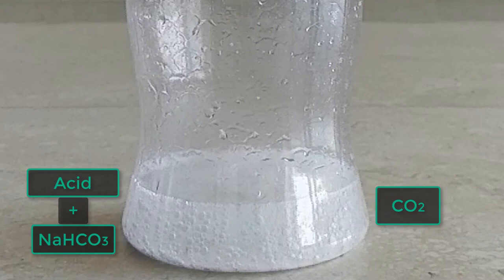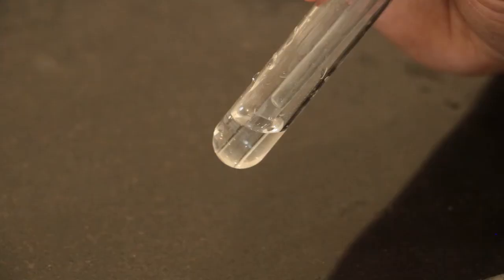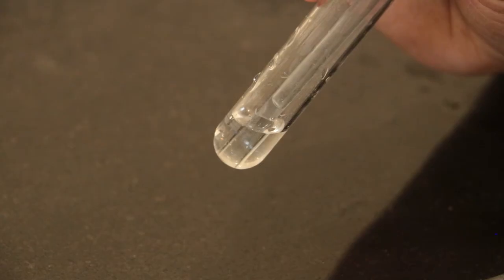So see, for that we are going to do a lime water test. For this, I'm going to pass this gas through a solution of lime water. By the way, in chemistry, whenever I say lime water, I do not mean lemon juice. I mean a dilute solution of calcium hydroxide in water. Meaning I'm mixing a very little amount of calcium hydroxide in a lot of water. That is called lime water. And you can see that lime water is colorless, just like water.